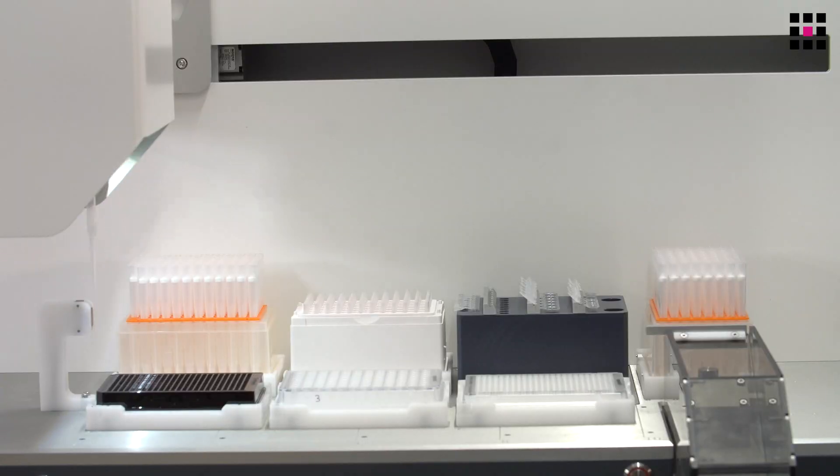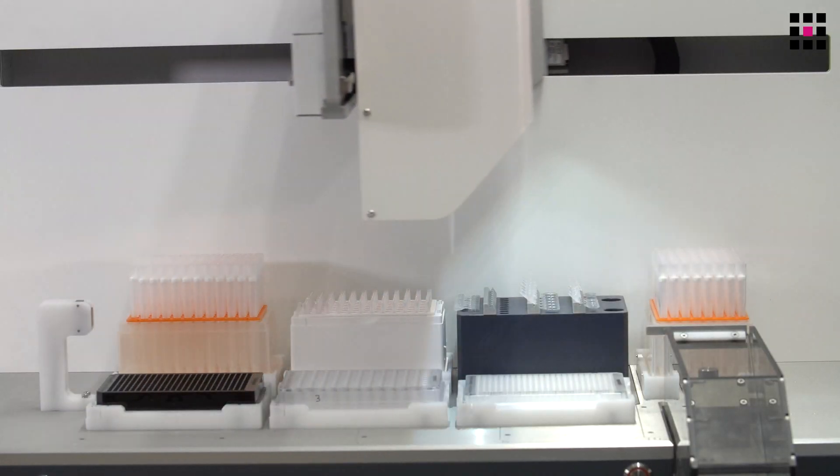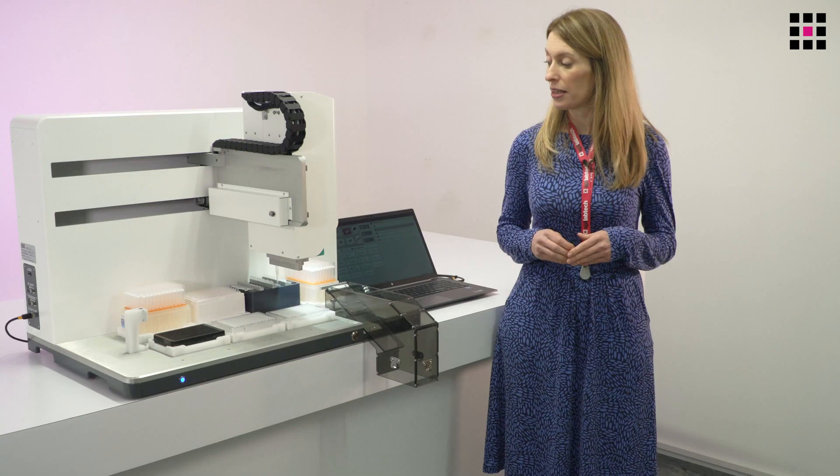The unique feature of the Apricot DC1 is the dual cores inside that mobile head, which enable both high volume and low volume pipetting using the tip boxes laid out on the deck. With that, the instrument enables pipetting across the full volume range, starting at one microlitre right up to a thousand microlitres.